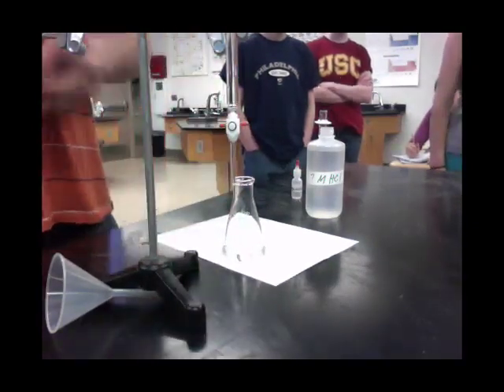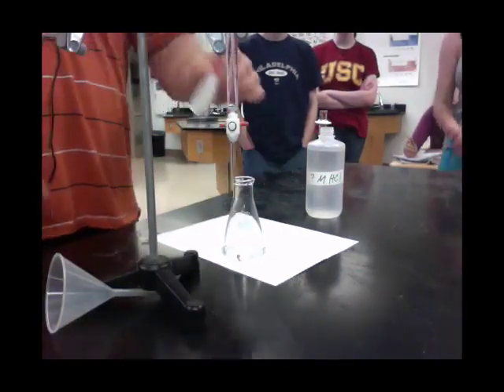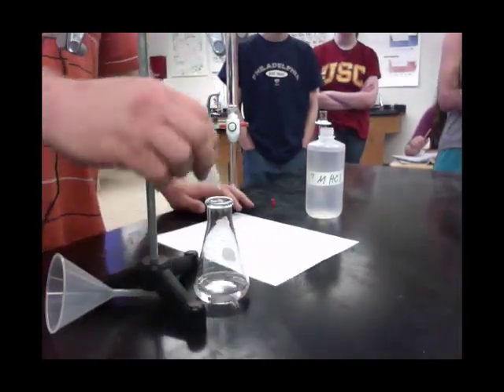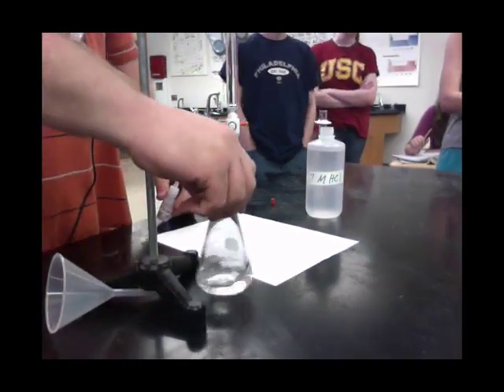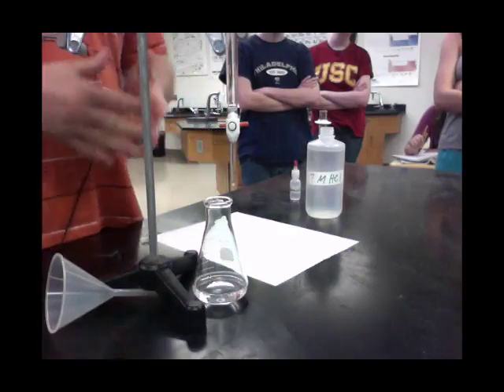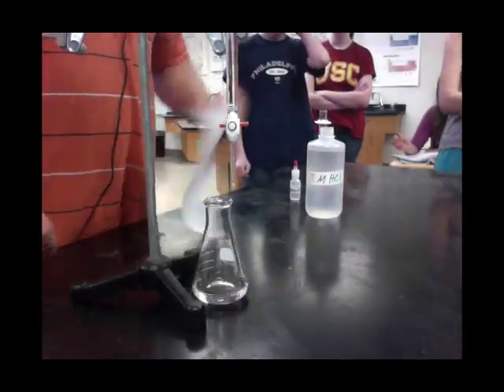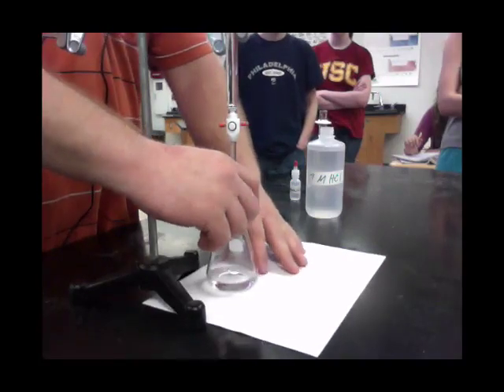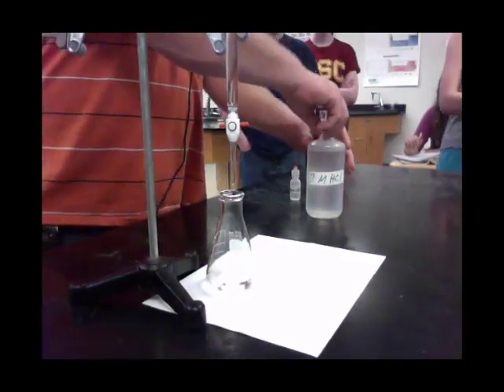Now I'm ready to start the titration. The number one thing you have to do is add the phenolphthalein. If you don't add the phenolphthalein, you won't get a color change. A couple drops is all you need. It stays clear when you are in an acidic solution and turns pink in a basic solution. So it should start off clear. You also need a white piece of paper underneath your flask so you can see the color change.